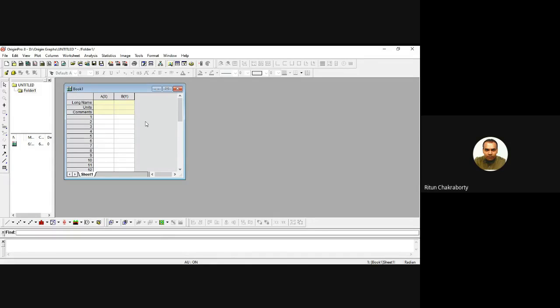Good morning. In this video, we are going to learn about Scherrer's plot. To know more about Scherrer's plot, you should check the note which I provided to you. In Scherrer's plot, mainly the broadening due to the crystalline size or nanocrystalline size is taken into account, but strain involved due to nanocrystalline size effect is not exactly taken into account. The strain effect is considered in Williamson-Hall's equation and plot.